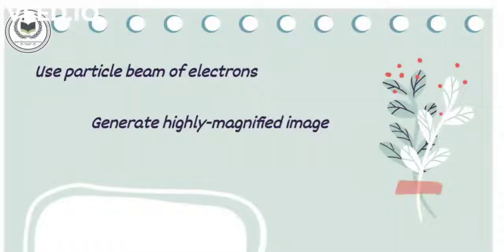In the physical, chemical, and biological sciences, transmission electron microscopy is a common analytical technique. Cancer research, virology, and materials science, as well as pollution, nanotechnology, and semiconductor research, as well as other subjects including paleontology and palynology, use TEMs.